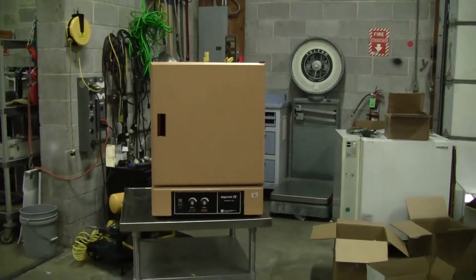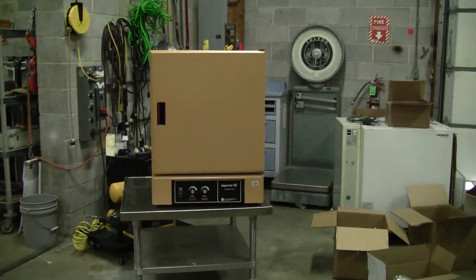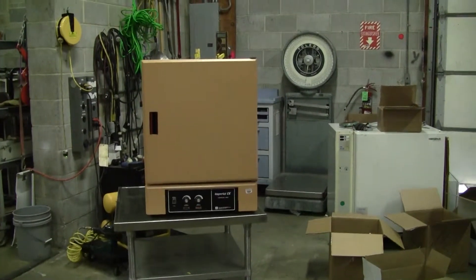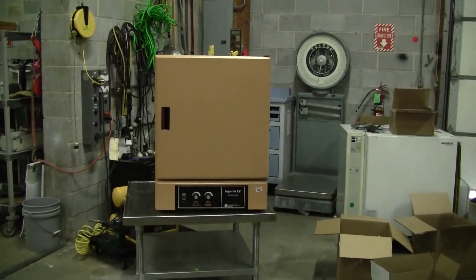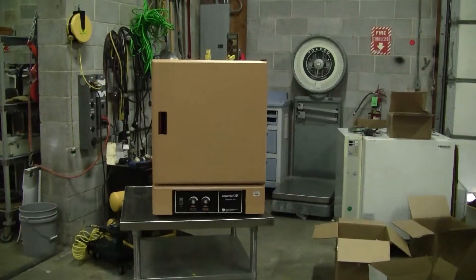Hi, this is Cody from HitechTrader. Today we are looking at a LabLine Instruments Imperial Model 3475M4 Laboratory Mechanical Convection Oven. The max temperature on this unit is 250°C. The low temp is ambient plus 10°C.